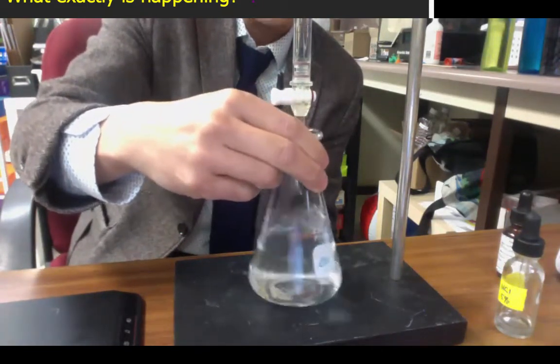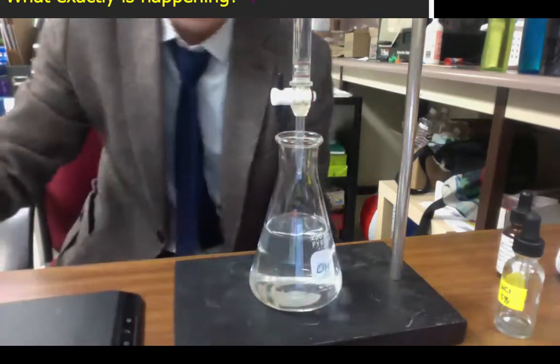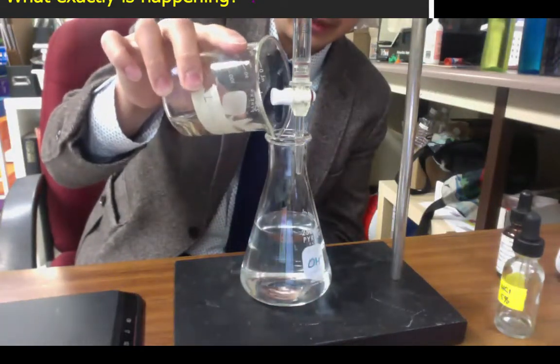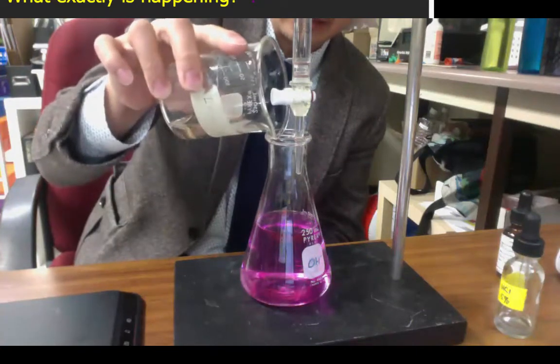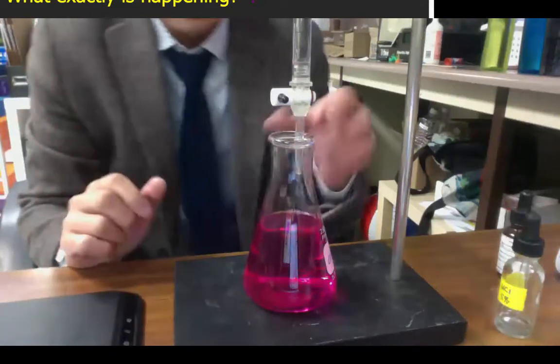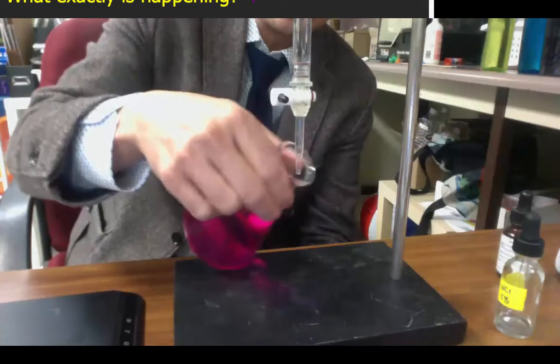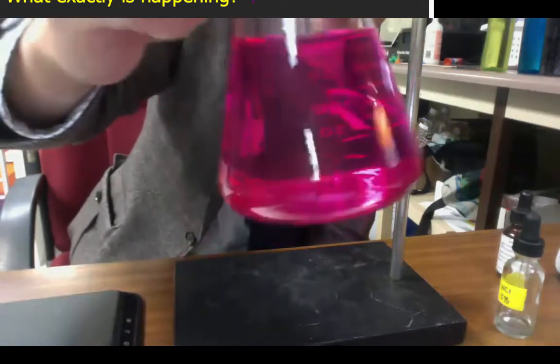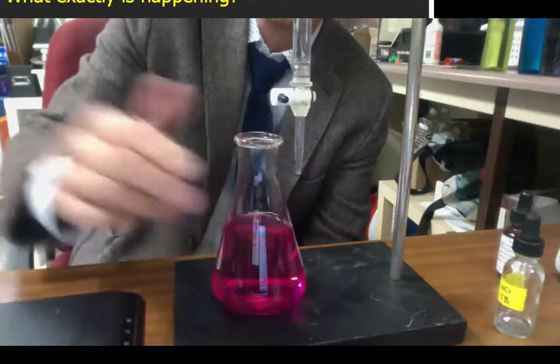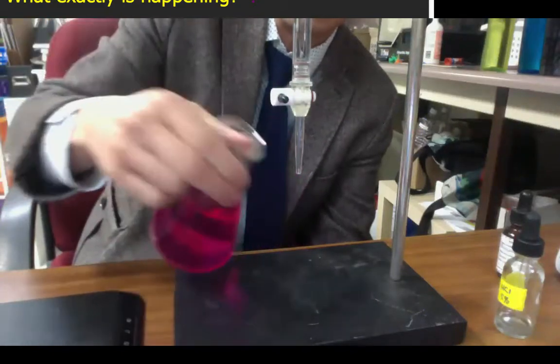And you can see that it does turn pink a little bit, and for titration it does take a lot of time. And for time's sake, I'm just going to show you what I mean by the equivalence point here. Of course, you don't want to be doing this with another beaker. And as well, you can see right now, this is really pink because I poured from the beaker. This is what they call overshooting, because right now the intensity of this color is really strong. That means I have overshot. That means I actually went over the pH range, and I have gone over the neutralization point. You don't want to do that.